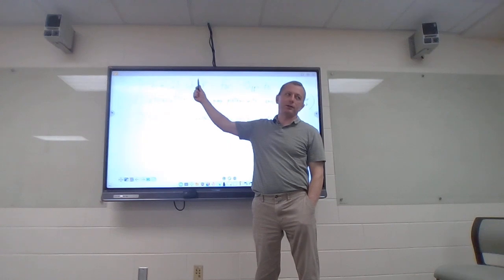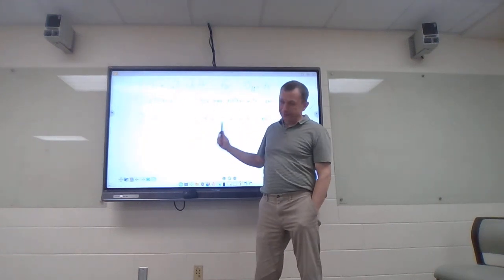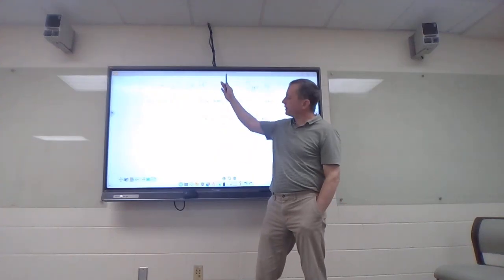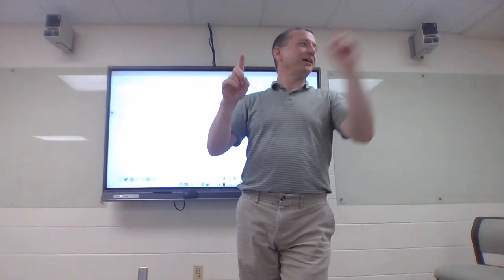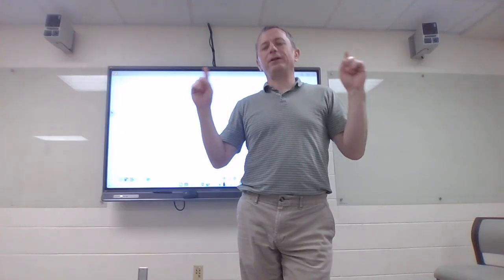When you get a lot of carbons, a lot of hydrogens, cyclic structures, things like that, it does get a lot hairier, and we're going to avoid that. But that's when we start to rely on what we call two-dimensional NMR, where I'm looking at hydrogen relative to carbon, one bond away, two bonds away, hydrogen relative to hydrogen, and one of the other favorites, called NOE.